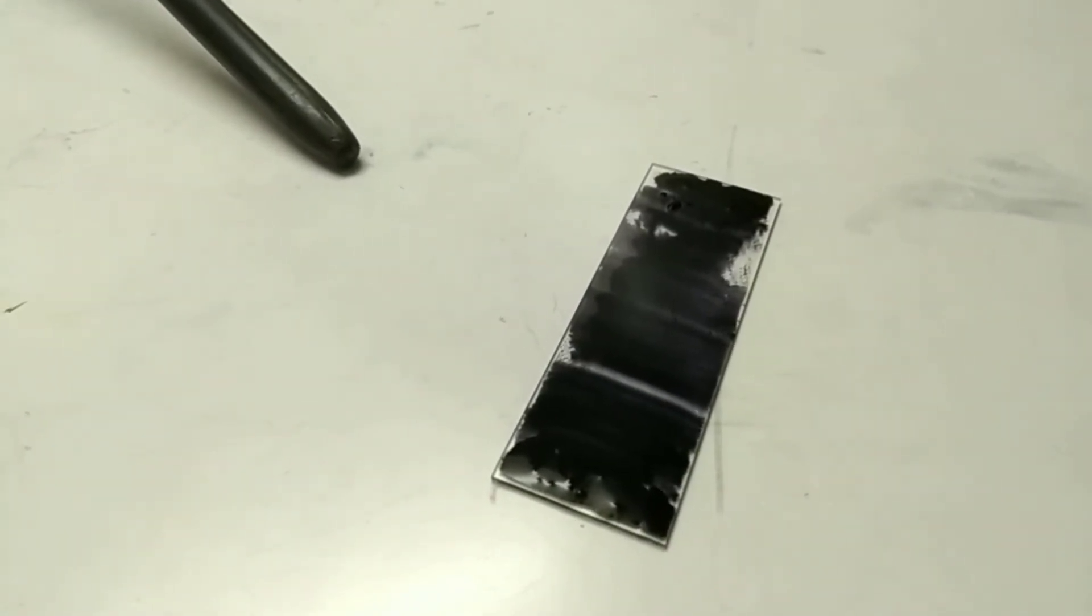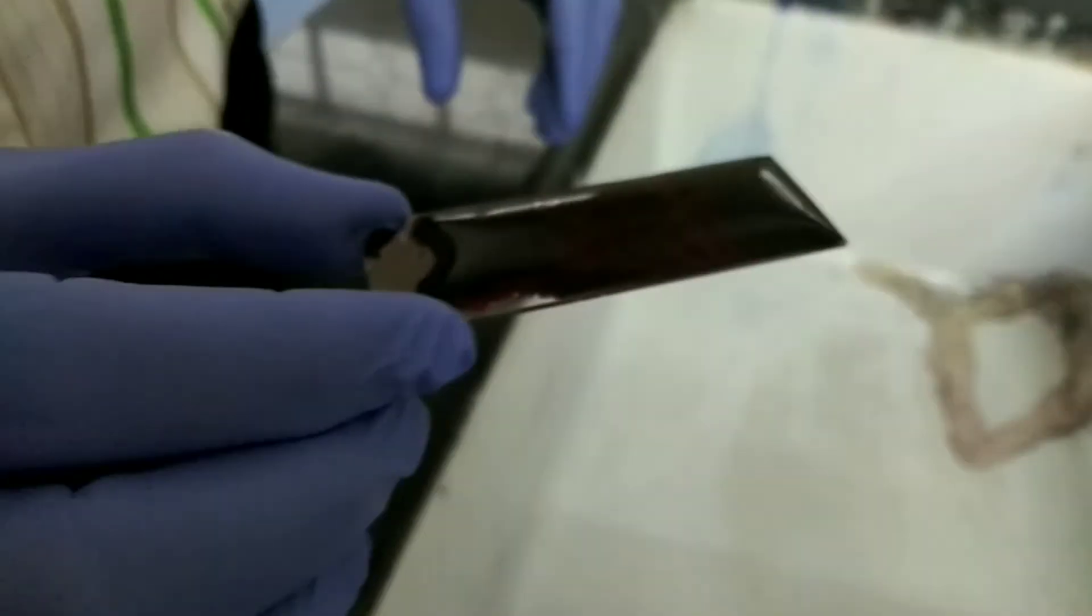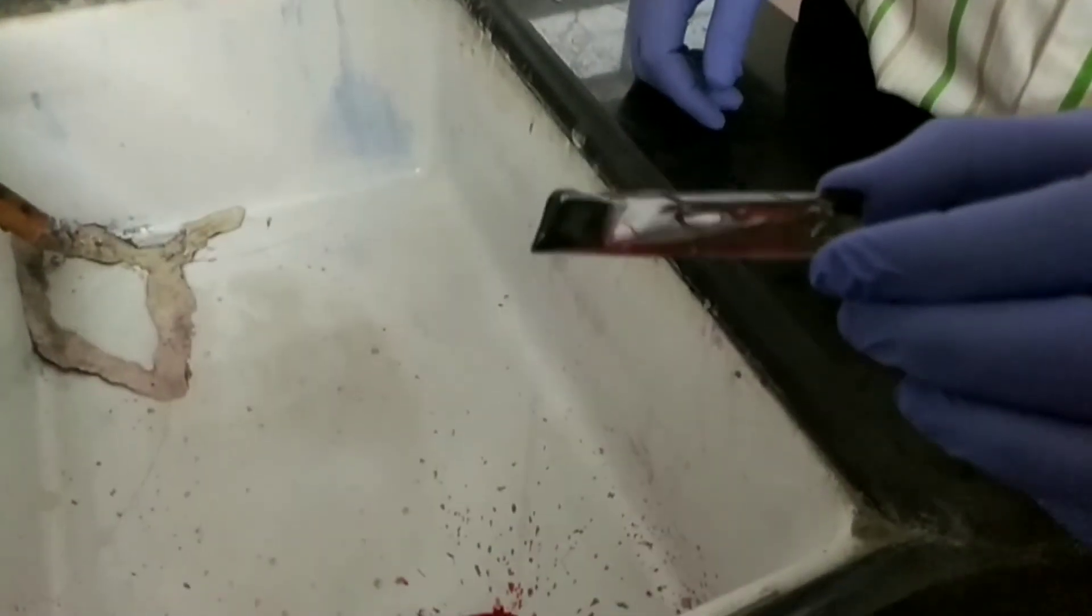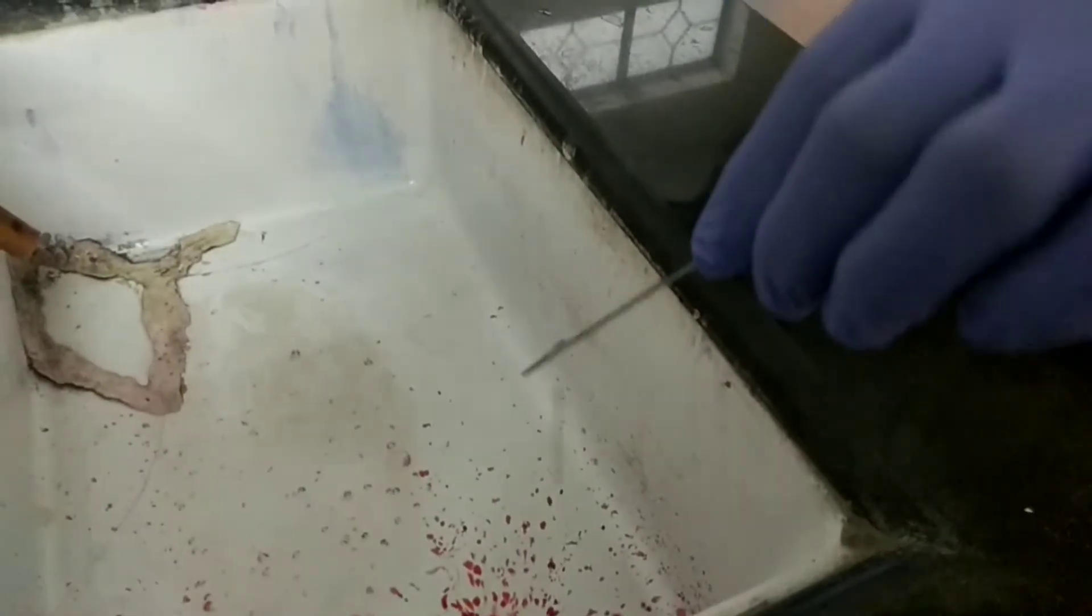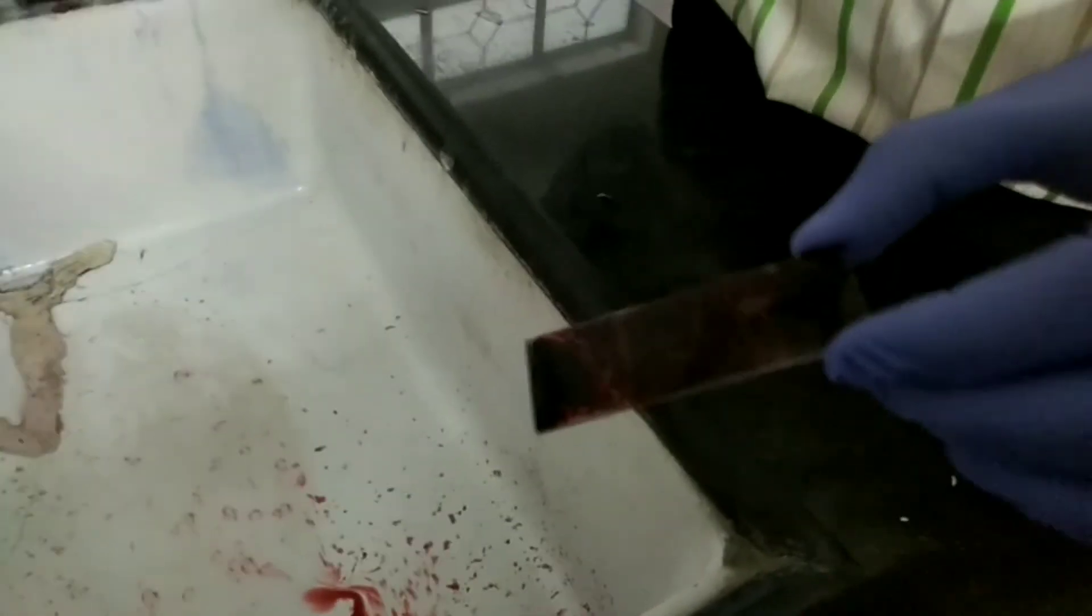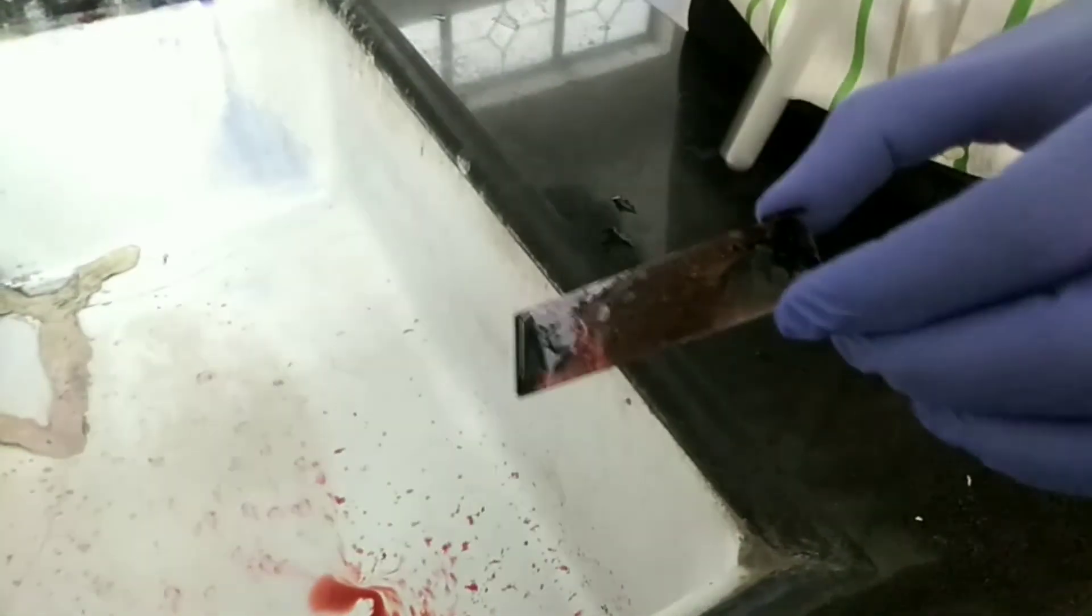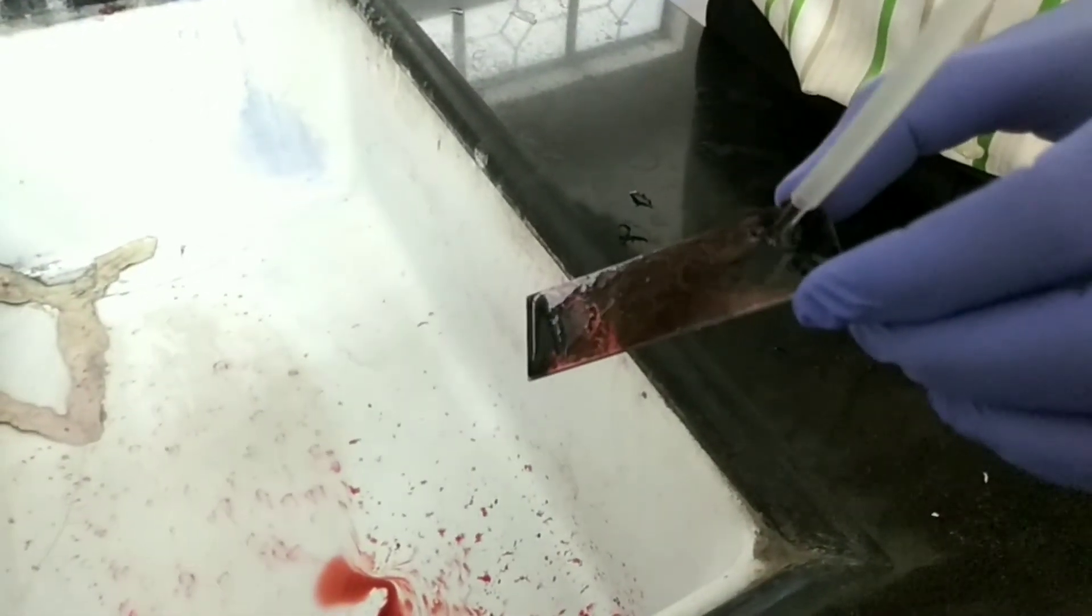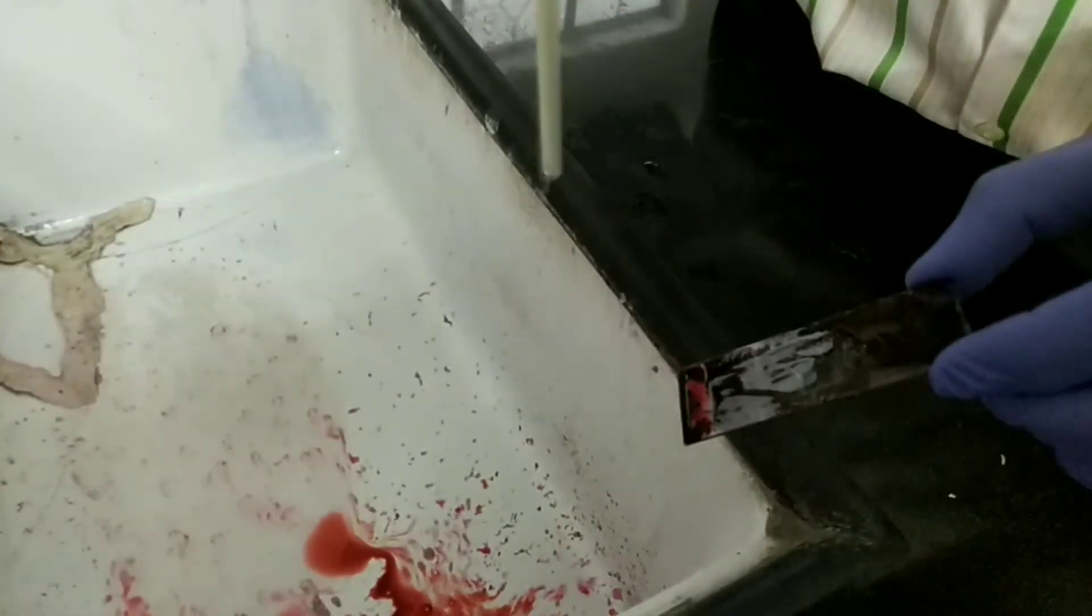After air drying, counter stain the film with safranin for 30 seconds. After 30 seconds, drain out all the rest of the safranin and wash the slide gently with water. Remember that you have to wash the slide very gently because harshly washing the slide with water will remove all the capsule and you won't be able to visualize them.